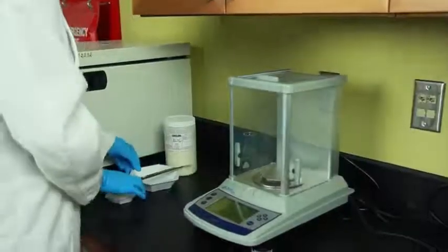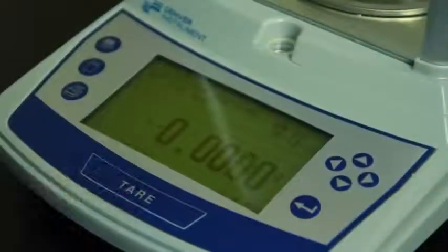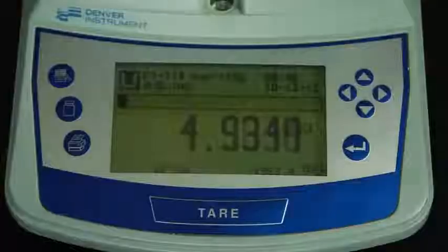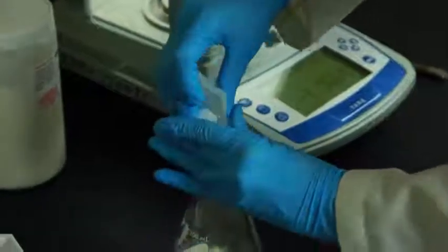For the next step, we need an analytical balance. Place a weigh boat onto the balance pan. Press the tare key to zero out the weigh boat. Use a lab scoop to add 5.2 grams of Brain Heart Infusion Agar to the weigh boat. Now add the powder to the flask.